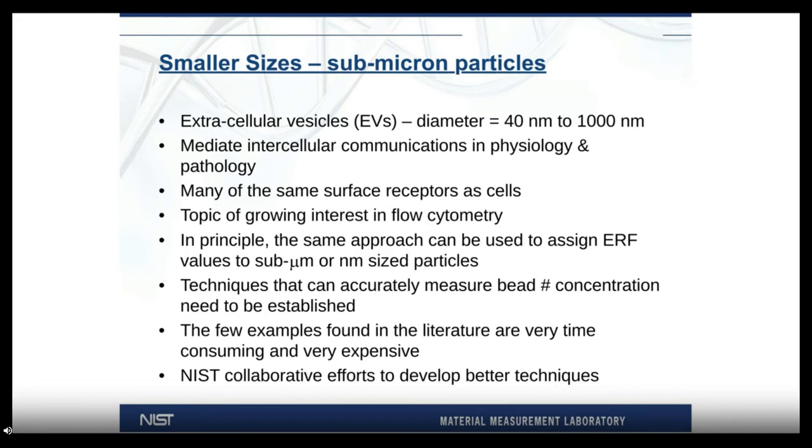EVs in particular are thought to mediate intercellular communications in physiology and pathology. And many of the same surface receptors as cells are found on EVs. So because of that, this is a topic of growing interest in flow cytometry.